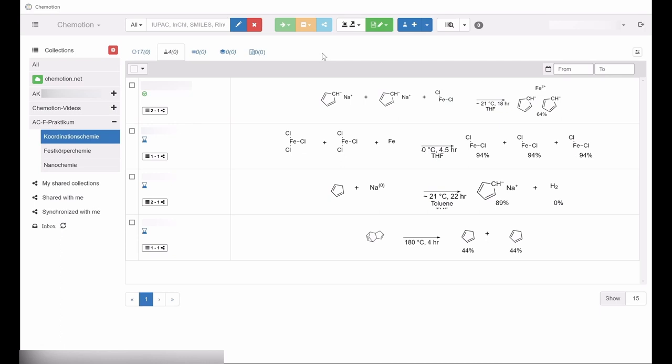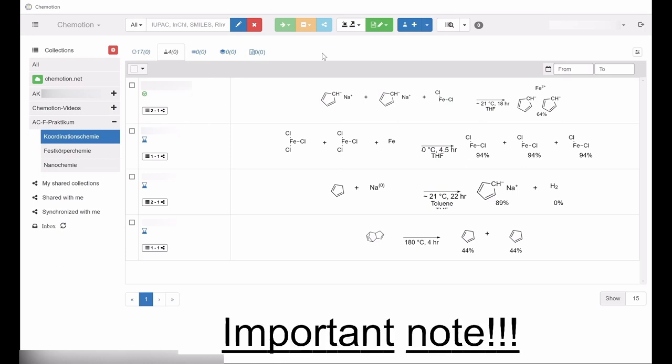In this context, we differentiate between the options sharing and synchronization. At this point, the following information should be highlighted. People with whom entries are supposed to be shared and synchronized must have access to the same commotion instance.